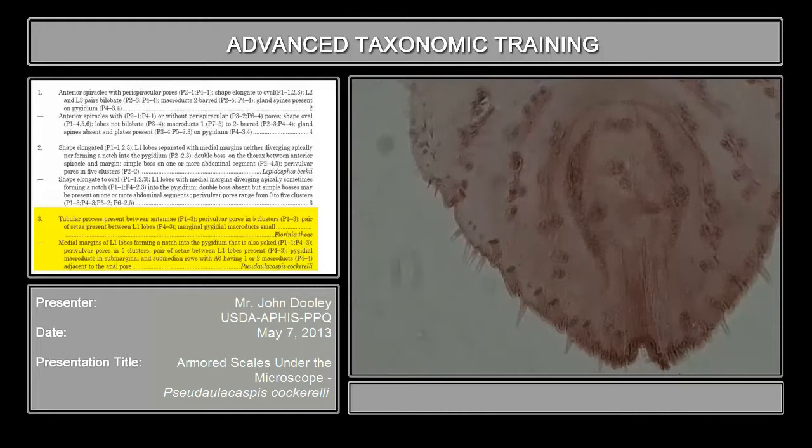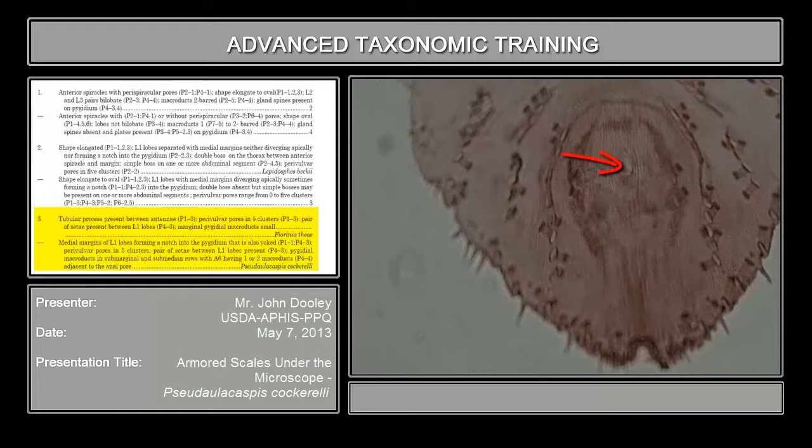Just as a refresher, which is still important to keep emphasizing: look at the marginal ducts, especially the ones that are real thick orifices like this. If you get them in really high power, you will also see that they're double-barred, and that's very, very important. The best place to look for the double-barred when the key asks for it is to go along the margin — they're the most obvious. And the last thing we're talking about is macroducts. Here is your anal pore.